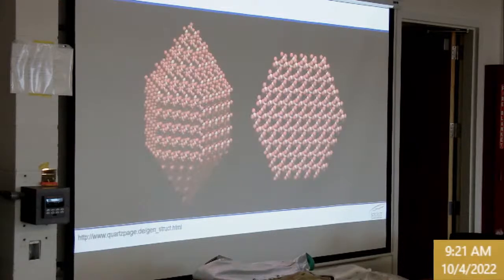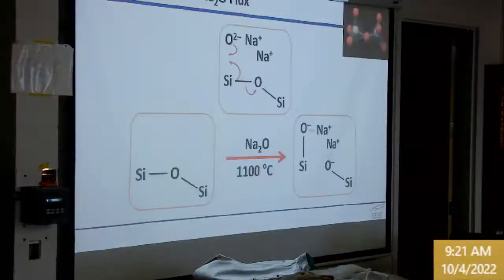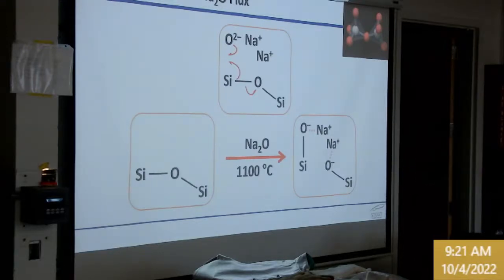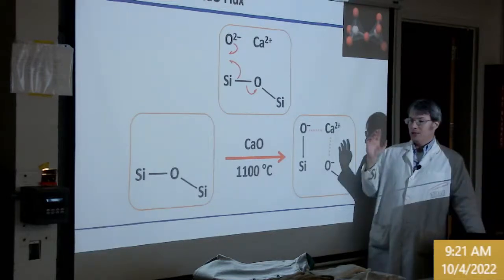Well, if we start messing up all those bonds, it's no longer going to be a crystal structure. It's going to turn into a glass that's going to behave in many respects like the parent crystal structure, but now it can no longer crystallize because the bonding regularity has been interrupted by all the ions. And we put in a lot, 90 grams of silicon dioxide, 50 grams of sodium carbonate, 25 grams of calcium carbonate. That's going to severely mess up the silica crystal structure. The calcium story is similar, but remember, we call this a flux stabilizer.